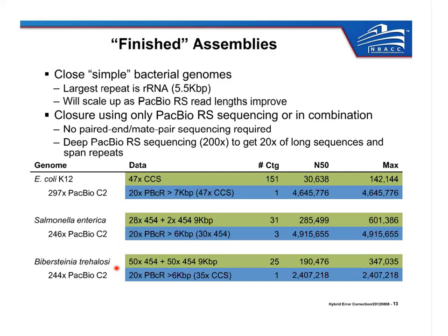And for comparison, I included what the best assembly we could get was with the complementary data alone, so the data we used for correction. And you can see in all cases, it's significantly worse. In the best case, there's 25 contigs, so that's how many gaps. Basically, you have to look at all those gaps, figure out what goes in that sequence, and try to do manual PCR and other manual finishing processes to put that together into the one piece that we can get automatically.